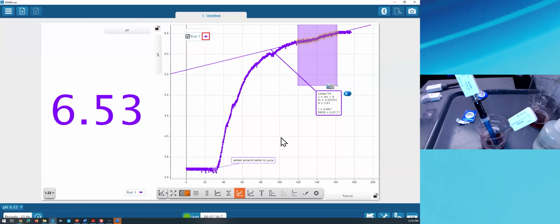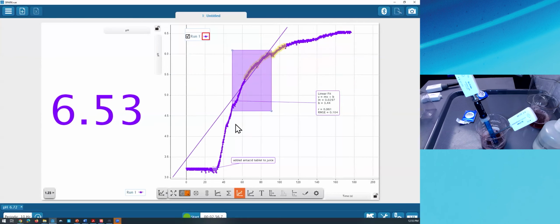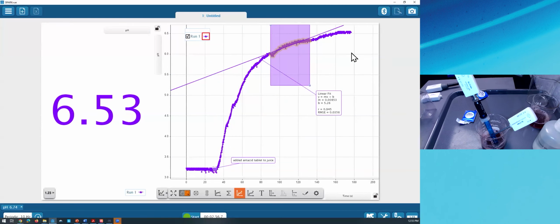All right, great. So that's a quick introduction to connecting sensors and visualizing the data, especially in a graph display, and some of the key things for doing data analysis in the graph. Sometimes we use tools like the coordinates that analyze points, and at other times we analyze either entire runs with something like linear fit or turn on selection mode to change which data points we're actually analyzing.